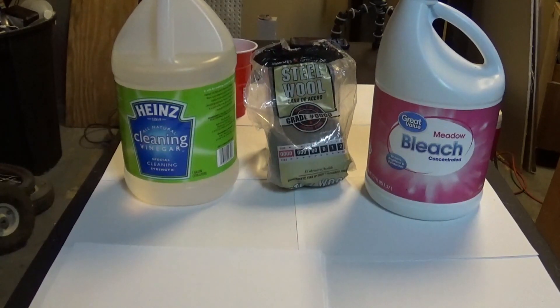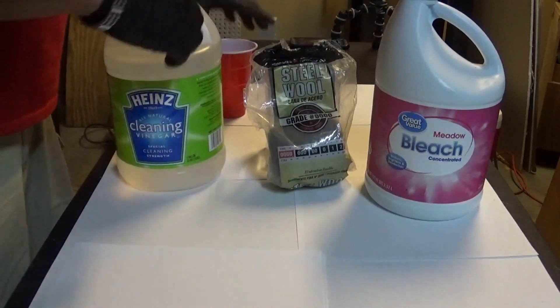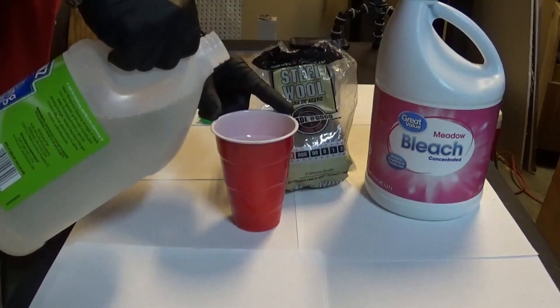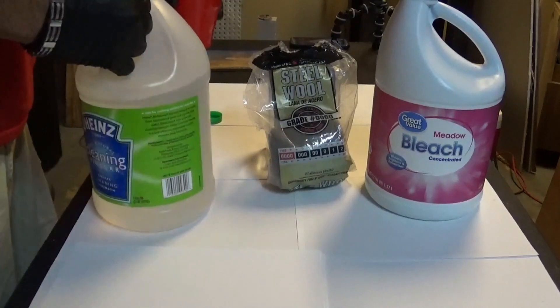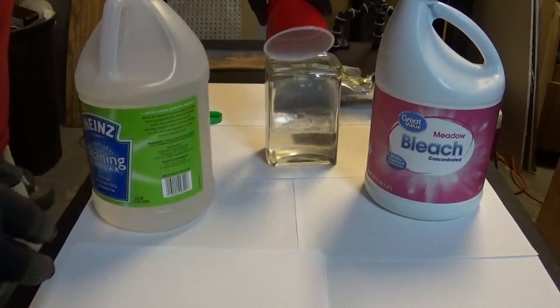I grabbed a cup and I'm pouring the vinegar — about half a cup. Now I'm going to pour it into this square jar. There we go.